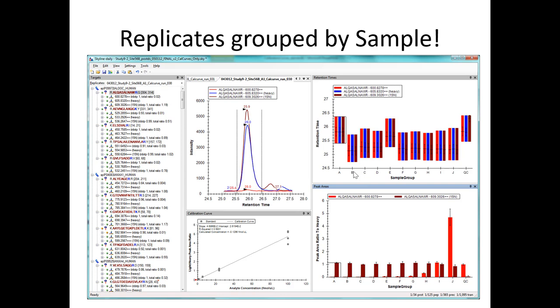But if you click through, again, just click on each peptide and you'll be able to see different things. You might be able to see that some have very good reproducibility, some have very poor, some the peak area for the brown, which is the heavy protein spike, it may not be consistent. And so you can sort of quickly go through a large volume of data by having a view like this open without actually looking at chromatograms.